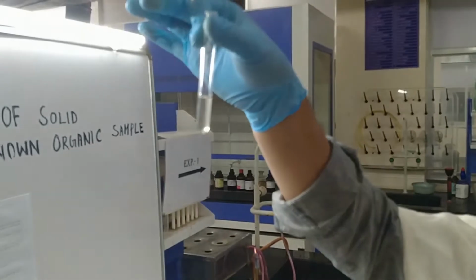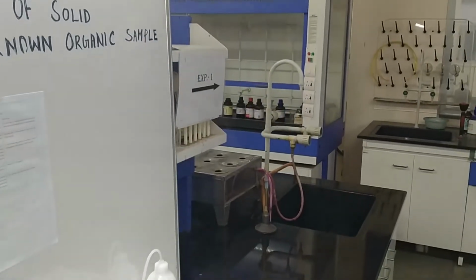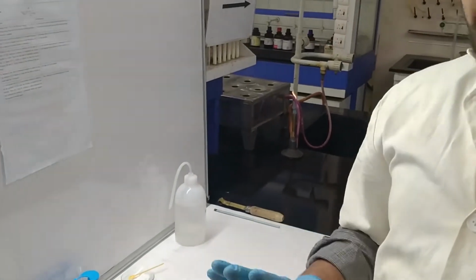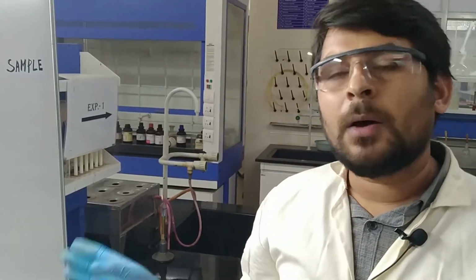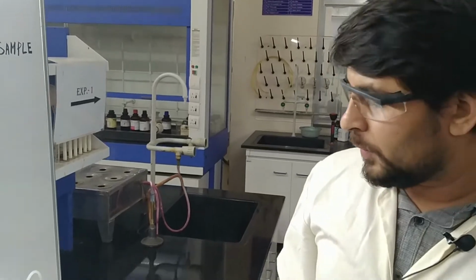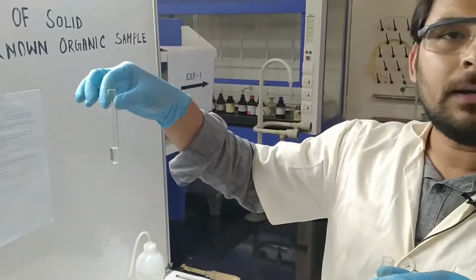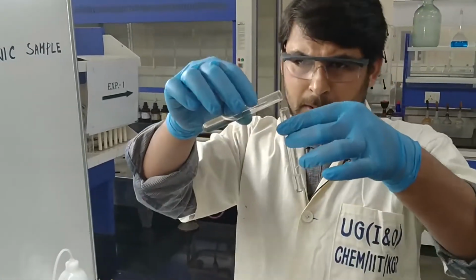Okay, so this is the Tollens reagent. For the Tollens test, I already prepared Tollens reagent. Now I have to add this Tollens reagent into the aqueous solution of glucose. The aqueous solution is already prepared over here, so I am going to add this into the glucose solution.